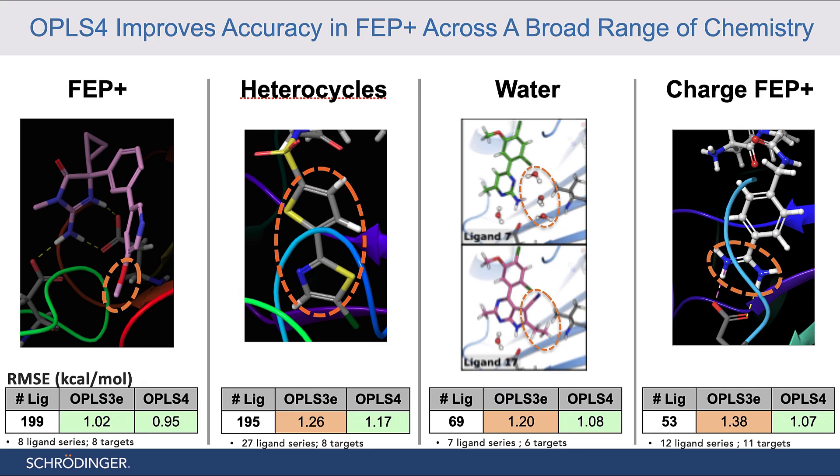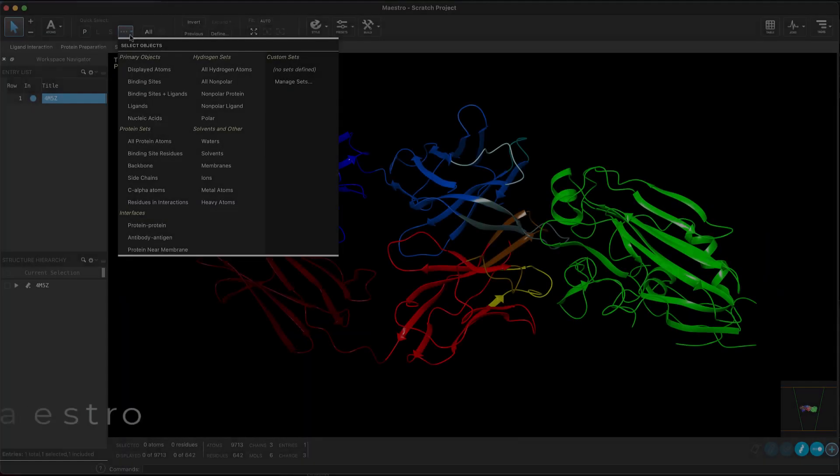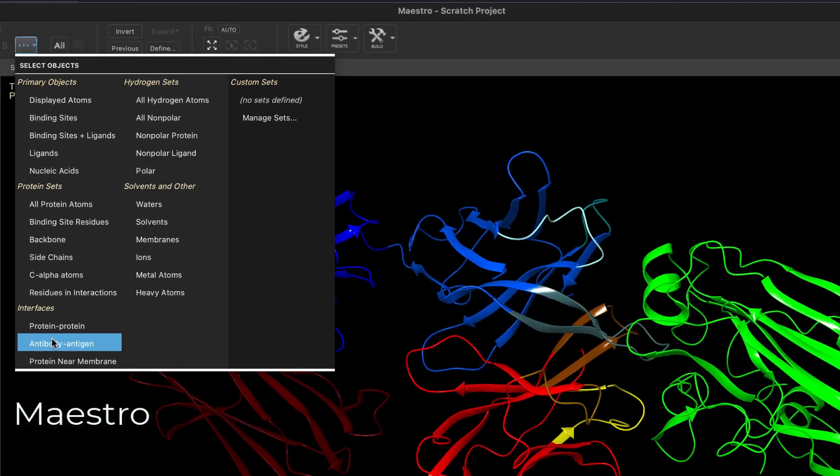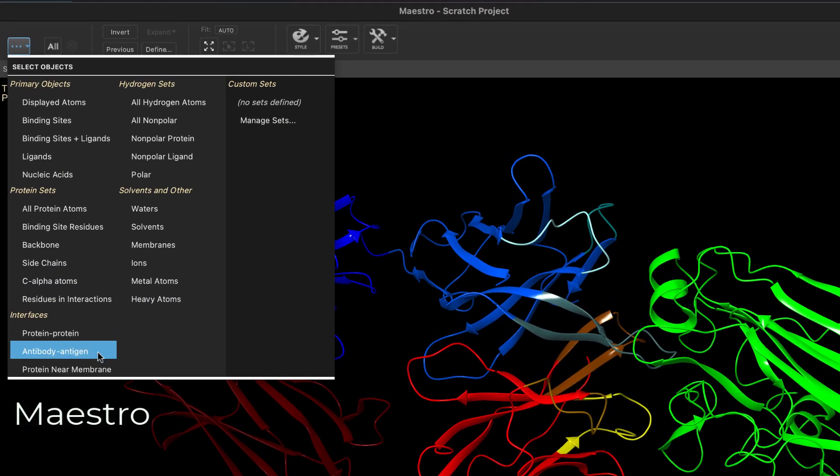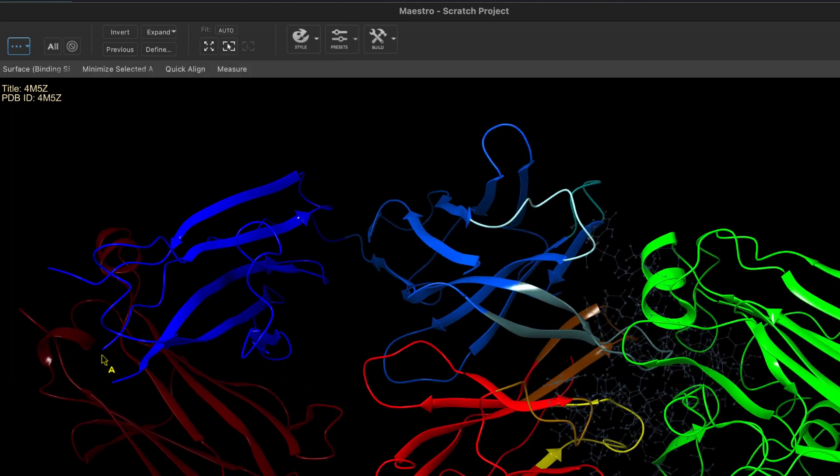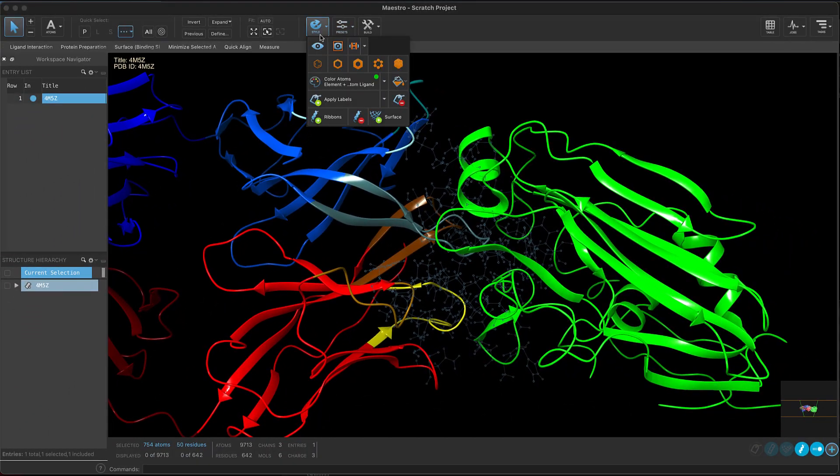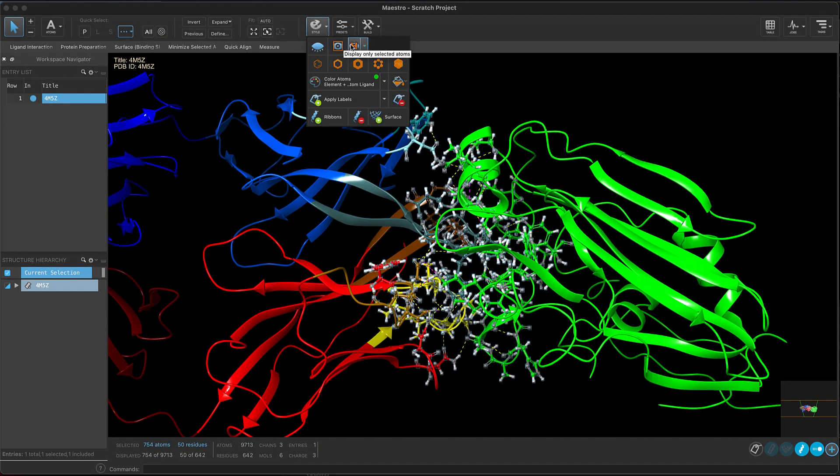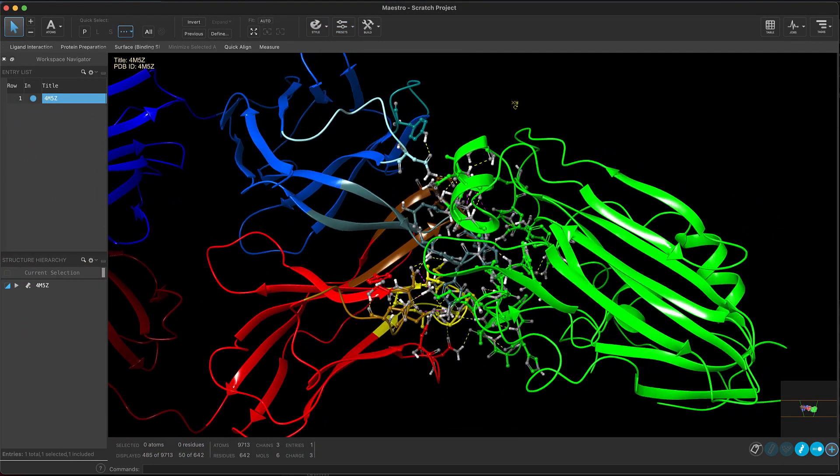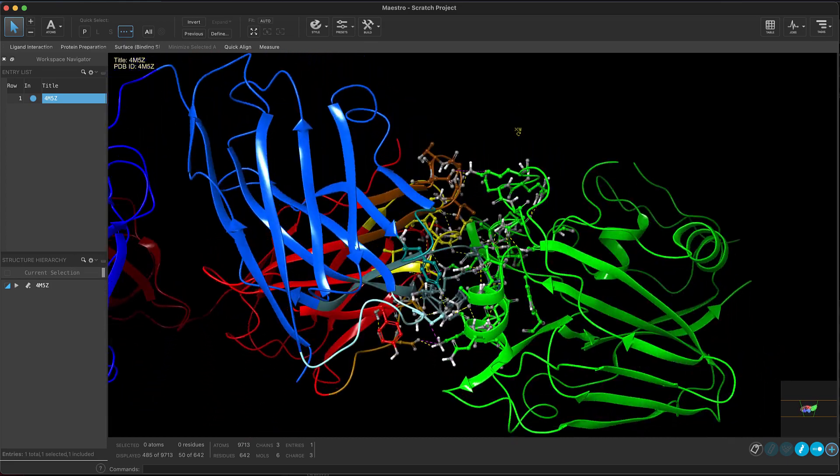In Maestro, we see a new option to quickly select an antibody-antigen interface. This can be useful for visual inspection or refinement such as after a protein-protein docking.